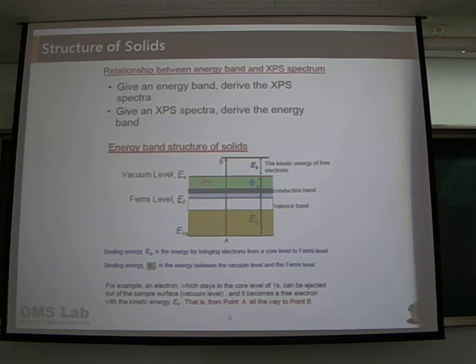We don't understand your point. I mean, the vacuum level. It says here the vacuum level is the level after the electron from the core is fully ejected, so there is no electron. That is the vacuum level. It is the lowest energy; when the electron obtains the energy, it is fully ejected, so there is no electron. That is the vacuum level.